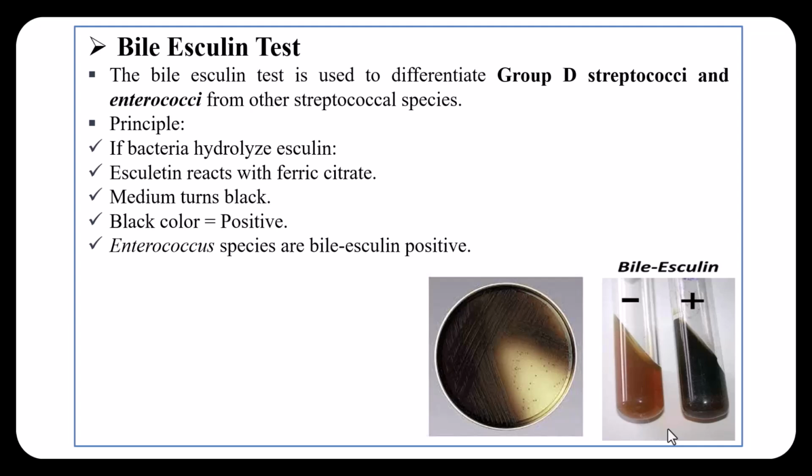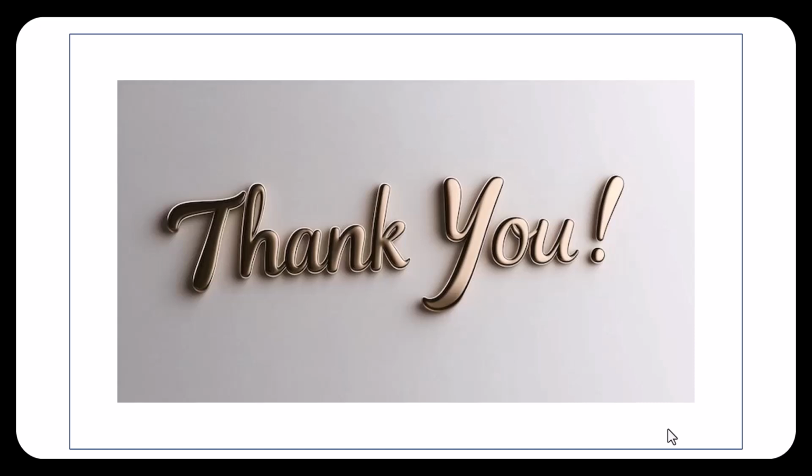And Enterococcus species such as Enterococcus faecalis are bile esculin positive because they can grow in bile and hydrolyze the esculin, whereas most other streptococci are negative because they cannot tolerate the bile salt and cannot hydrolyze the esculin in the media. And that's all about this lab.